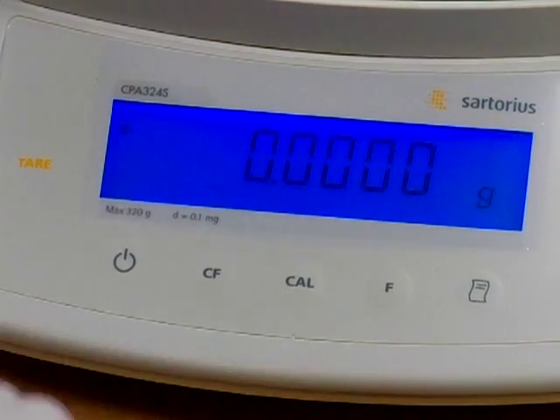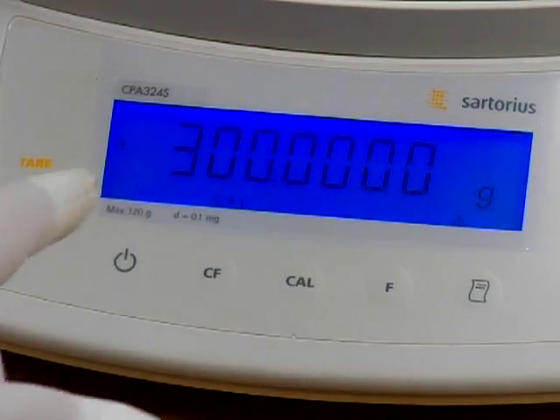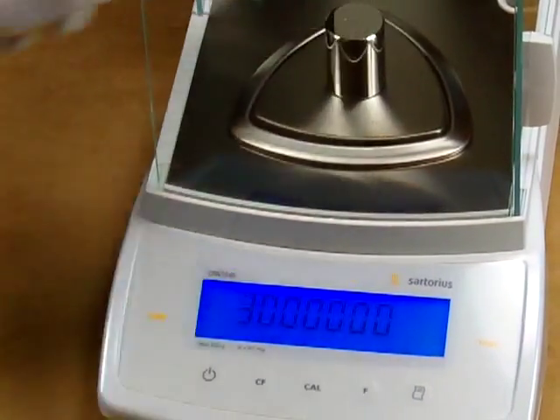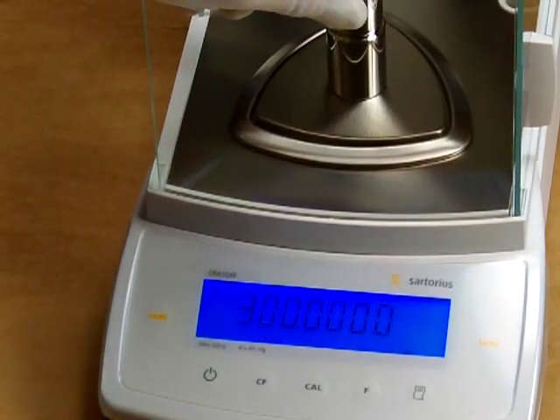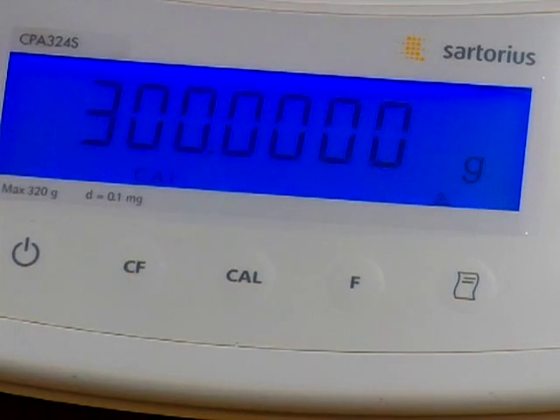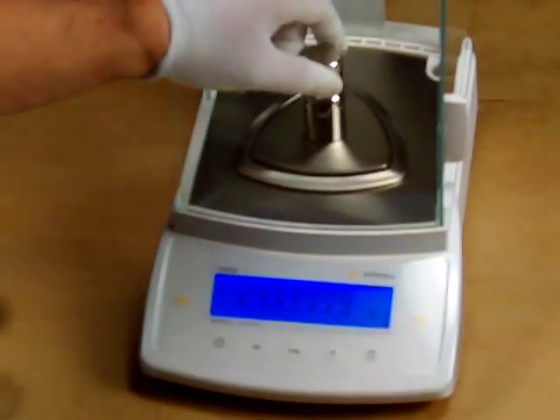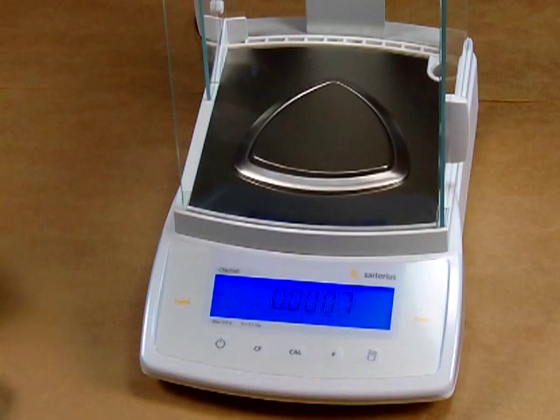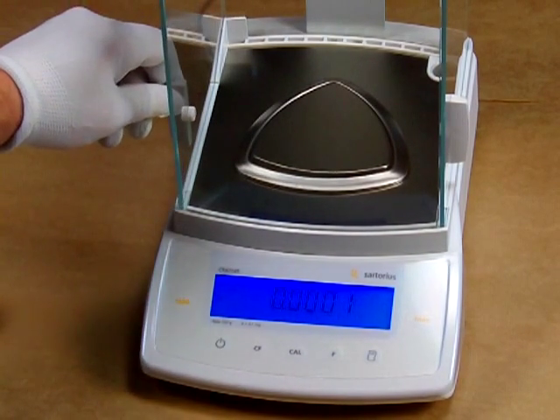To perform the external Cal, we simply press the Cal key again and it displays that we need 300 grams of weight. I have a 200 gram and a 100 gram class 1 weight. Place them on the balance, close the doors. The balance will show C and then CC to confirm it stored the value, and we have 300 grams right on the money. Now we remove these weights.